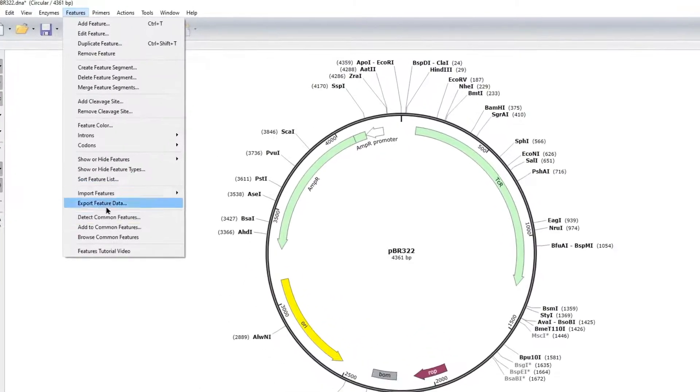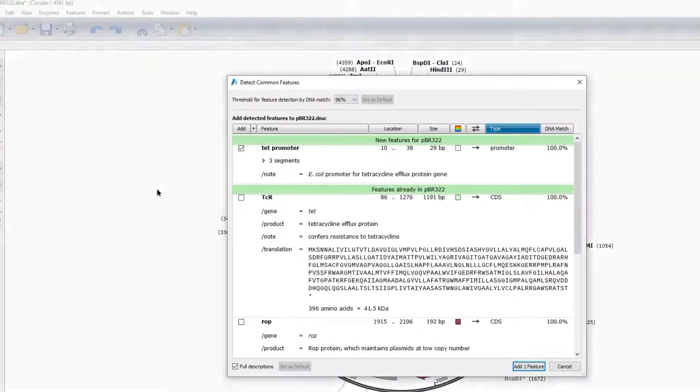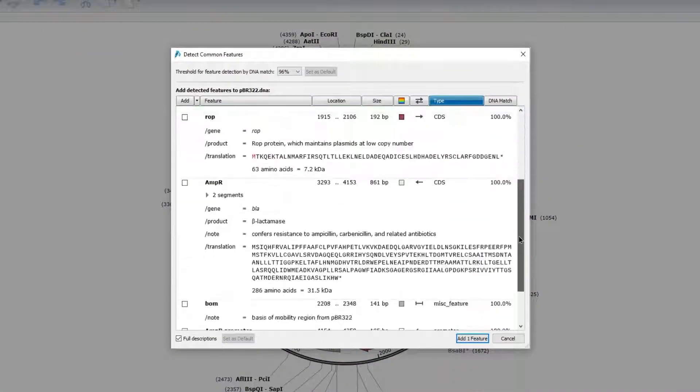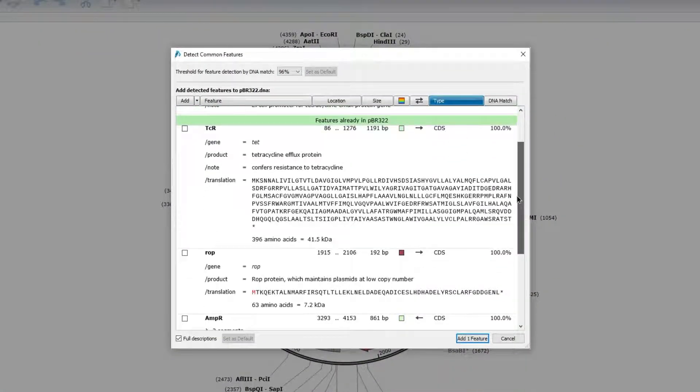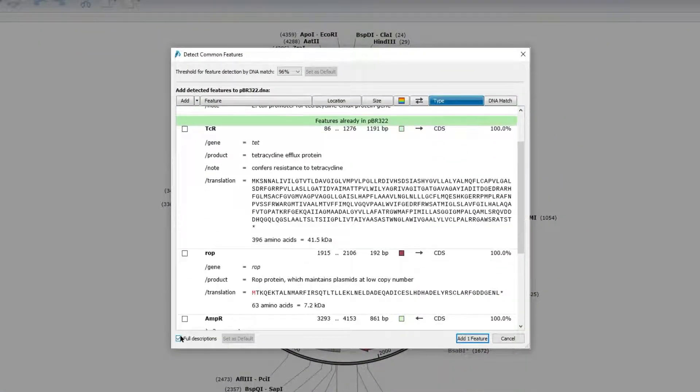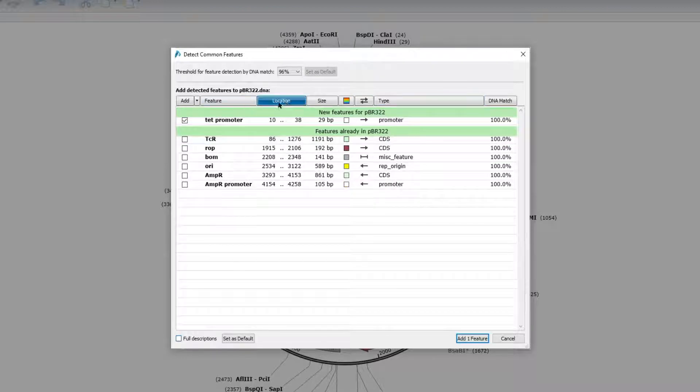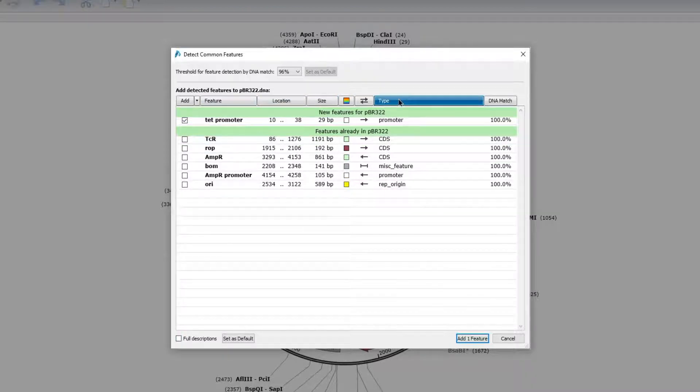The Detect Common Features option allows you to scan, view, sort, and add features to your sequence.